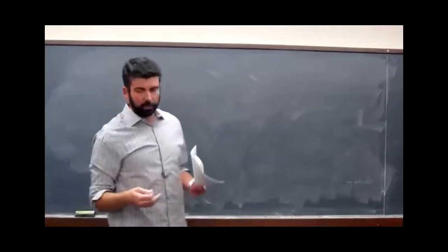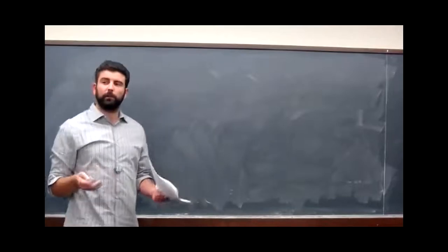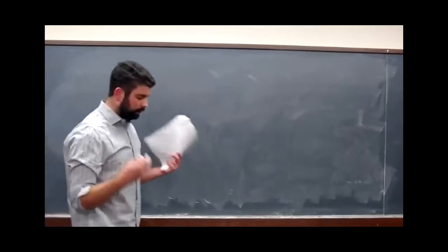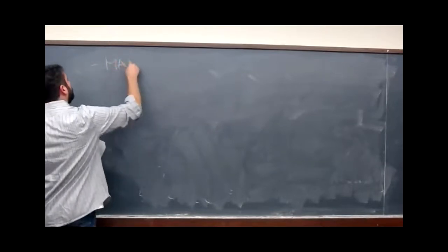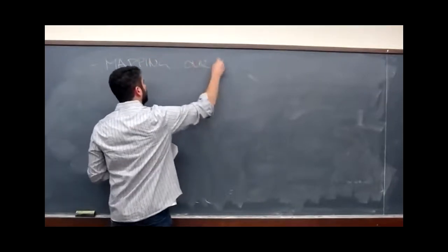The last thing I want to talk about is, so we've analyzed our peaks, we've pulled out information about the volume that's present, maybe the average lattice plane spacing for the subset of crystals that are pointed in a certain direction, maybe the distributions of strain. How can we look at this data and get an understanding of the anisotropic response? What's typically used is a pole figure, and we're going to talk about mapping our data to pole figures.